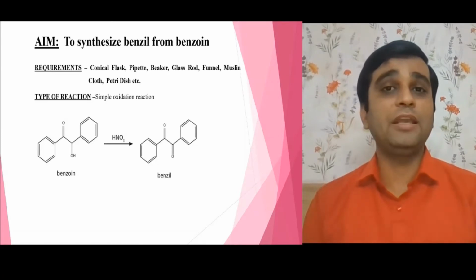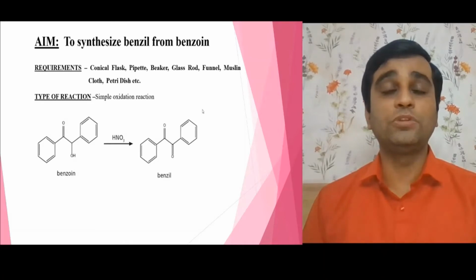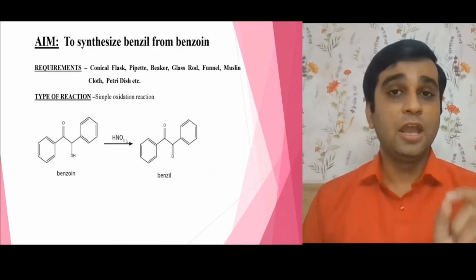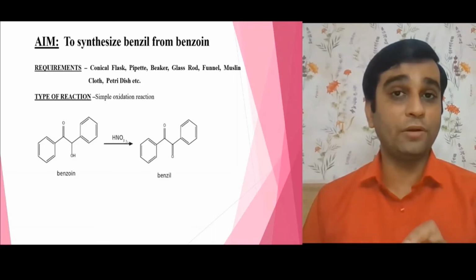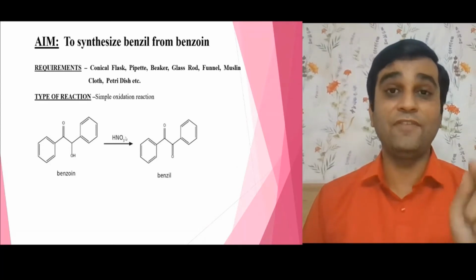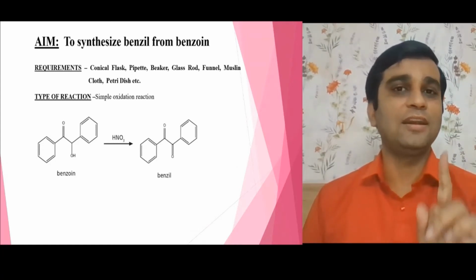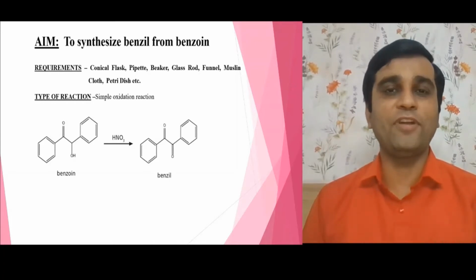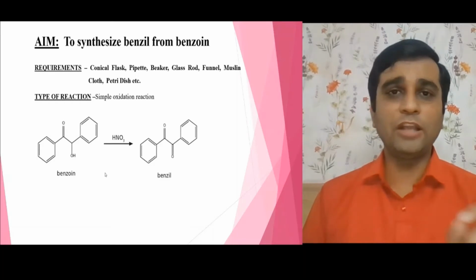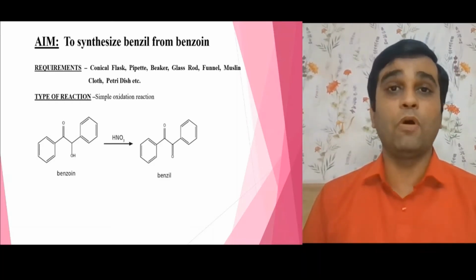If you focus on the chemical reaction, the benzoin is converted into the benzil in the presence of nitric acid. Remember one thing, this is not nitration, because on first sight, when we are using HNO3, our mind says that it is a nitration. It is not nitration. The type of reaction is a simple oxidation reaction. We all know very well what oxidation is. It is generally said to be the addition of oxygen or removal of hydrogen.